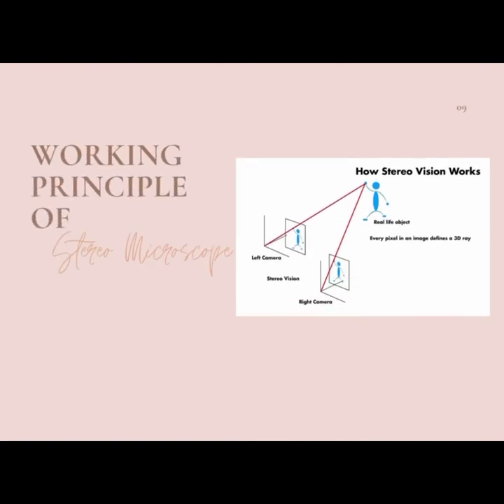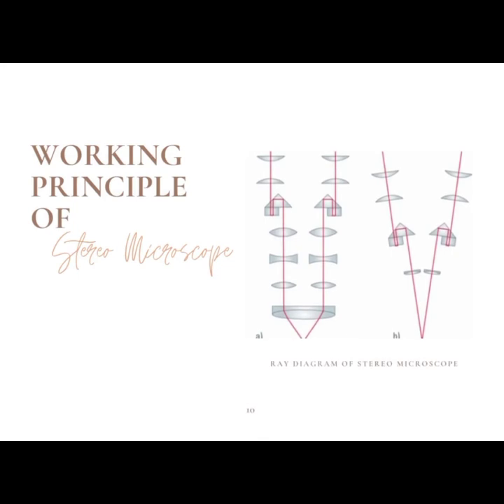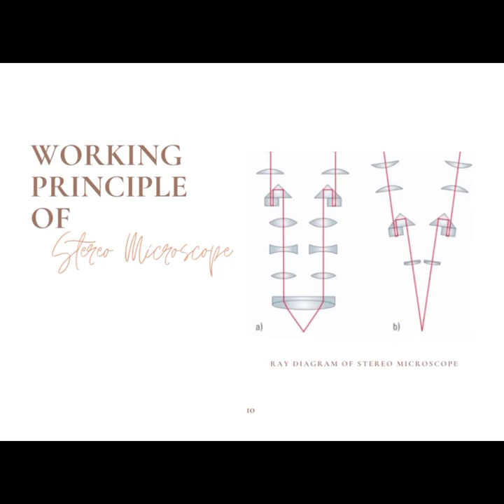The working principle of a stereo microscope depends on two light paths traveling through the objectives and the ocular lenses. Each light path provides a different angle, usually between 10 and 12 degrees, of viewing to each of our eyes. Our brain processes these two very similar but slightly different angle images into a three-dimensional vision. The two eyepieces enable a comfortable view of the sample from different angles simultaneously.